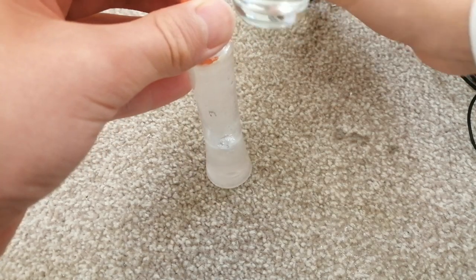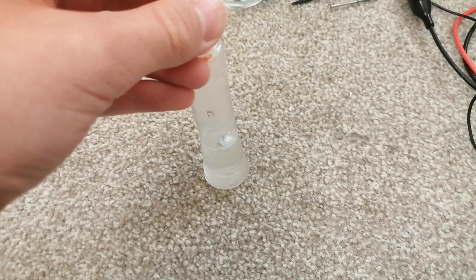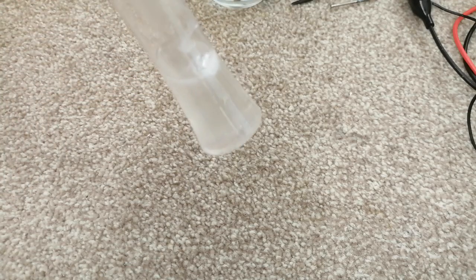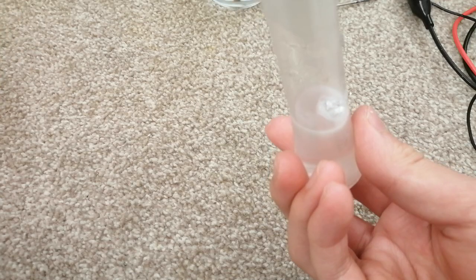But if you leave the solution outside, it will quickly absorb carbon dioxide and become sodium carbonate, which is less caustic. It's now fizzing quite vigorously. The gas now produced is hydrogen gas.